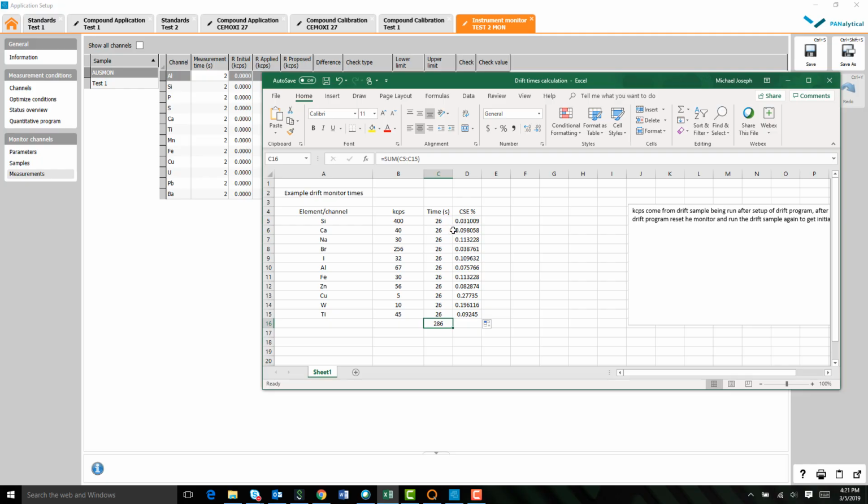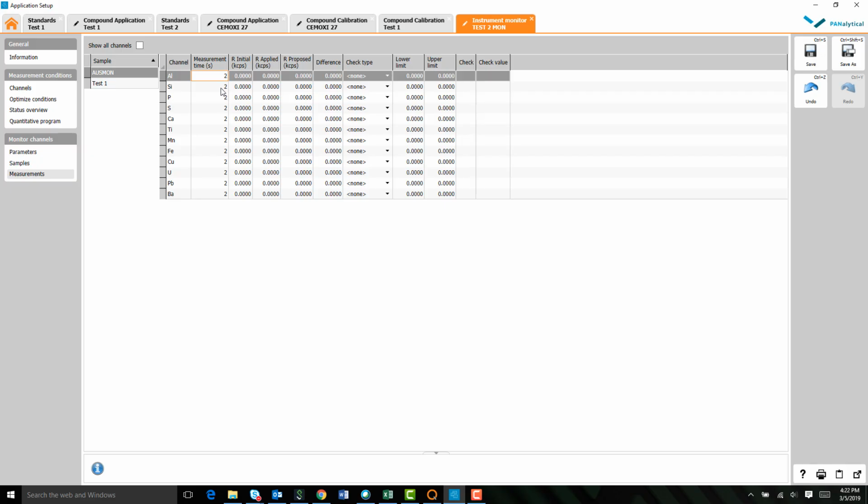And so when I go in here and I see, okay, 26 seconds isn't enough for that one, let's bump it up a little bit more, maybe 40 seconds. Okay, still not enough. Let's say 120. Getting closer, not bad. You might want to cap it out at 100. Maybe that's too long to wait 2 minutes sitting there for one element. That's okay. So just keep going there and work through these, and you'll have your total times. And you come back in here and you'll populate the measurement times necessary for each channel.